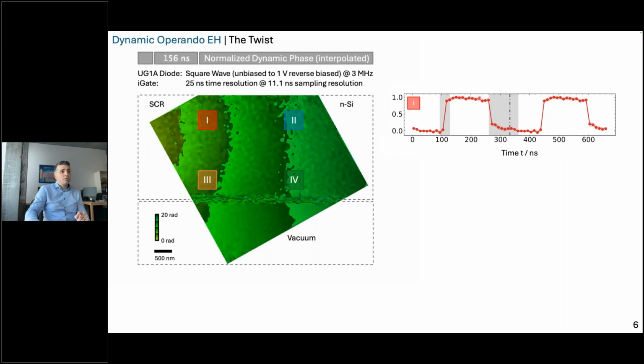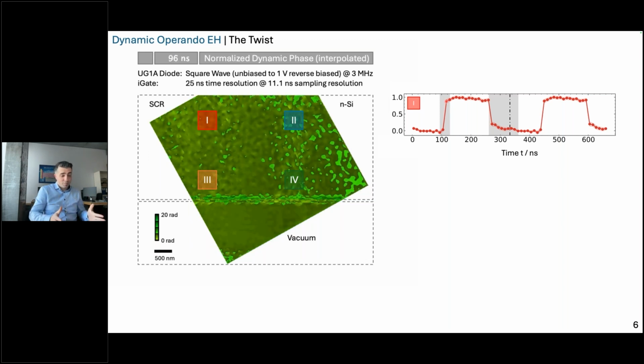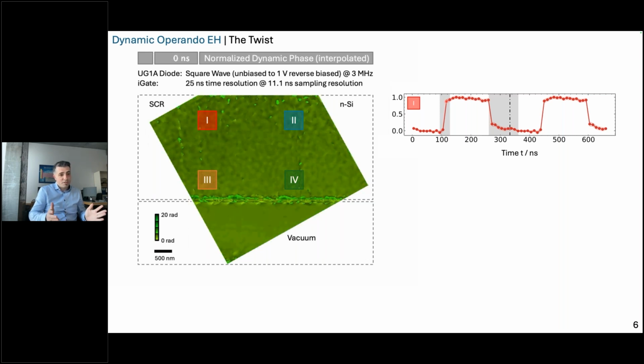So if we look at the phase progression over time for region 1, we can clearly see some behavior which is expected by a diode. So we see that switching into reverse bias, given that we have an external field applied, is happening rather fast. So we're talking about some 15 to 20 nanoseconds, the switching process. So it is very quickly switching into reverse bias condition, but then again, out of back to the unbiased condition, it takes a lot longer, nearly 4 times as long.